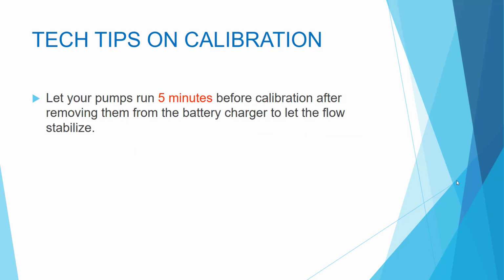Here are some tech tips on calibration. Best practice dictates that you let your pumps run about 5 minutes after removing them from the charger before you do calibration. This is just to ensure that the flow stabilizes after coming off the charger.